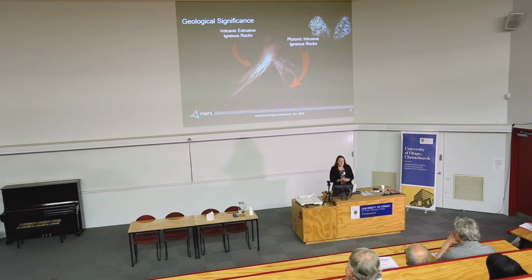The next is a volcanic extrusive igneous. So these form on the Earth's surface by the cooling of lava. And so when this lava cools, bubbles form in the lava and they freeze, and so this leads to pores. So we're interested in the pore size and connectivity, or porosity and permeability, and this gives us information on fluid flow through these pore networks at different reference sites.